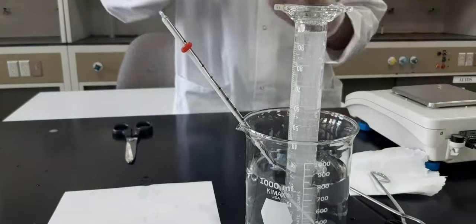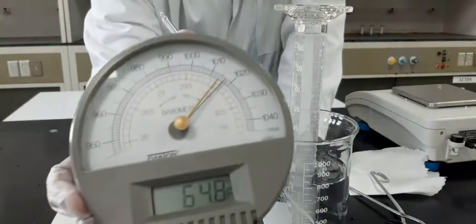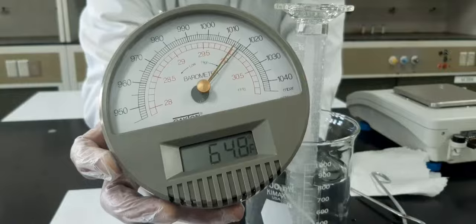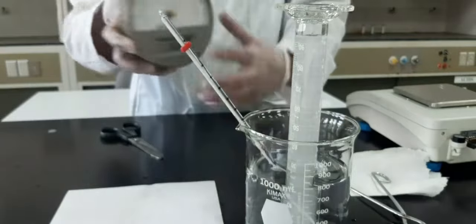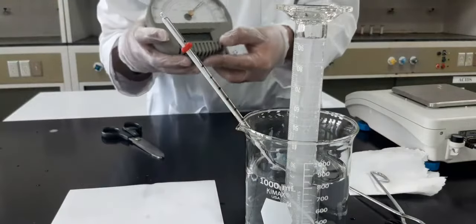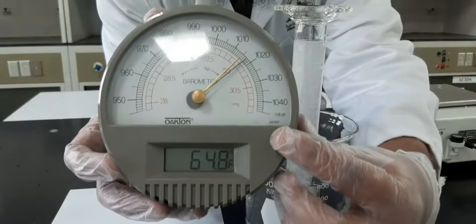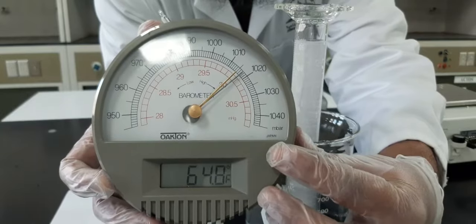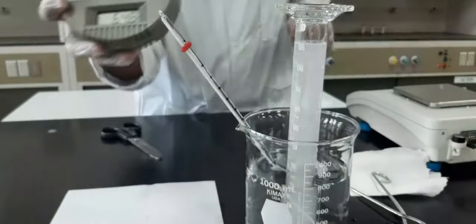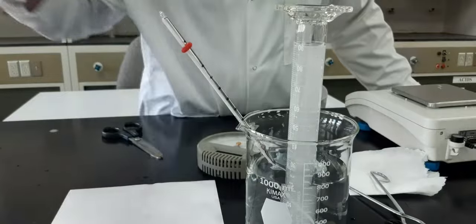To measure the pressure, you're going to use this device called a barometer. It's right here. You will see the black digits with the gray stick pointing towards them, and this is how it looks. But remember that this barometer shows the unit millibar. You are supposed to write the reading in your column in millimeter mercury. For that, you will change millibar into millimeter mercury by dividing it by 1.333.